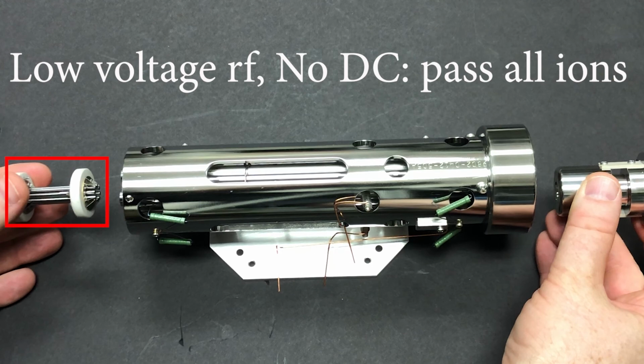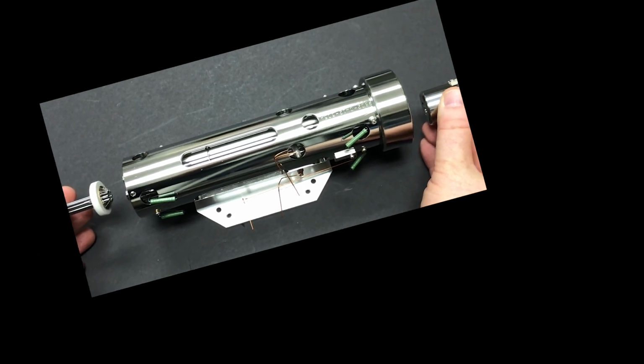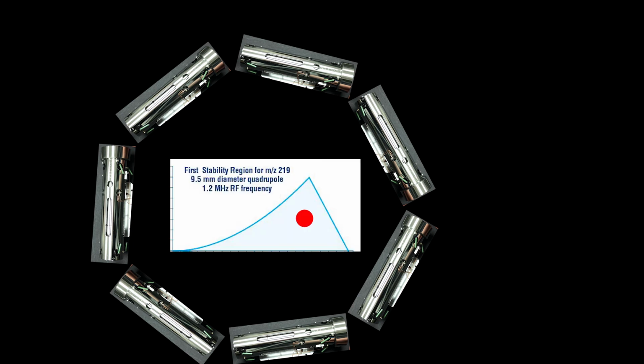So let's look at what we were just looking at, where we said, okay, we've got an octopole. We're going to apply low voltage RF. We've got this quadrupole. Let's isolate our quadrupole. And you know what? Let's put in another quadrupole. Let's make a circle of identical quadrupoles. Now we know that we can pick our RF and DC voltages to make certain ions stable or unstable. Let's go with our friend 219 here. We'll pick a voltage where 219 is stable.